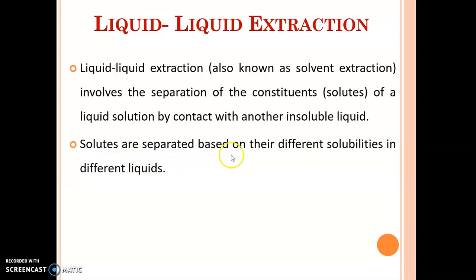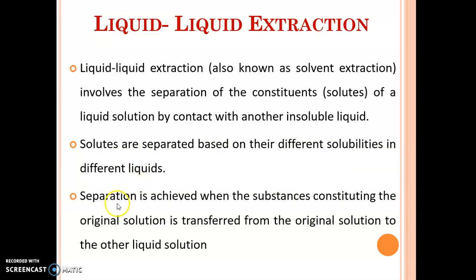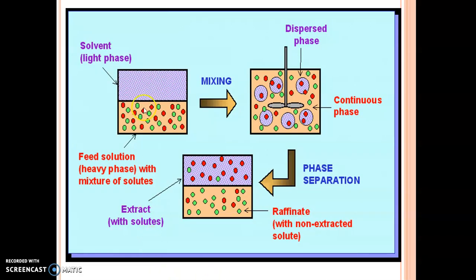Solutes are separated based on their different solubilities in different liquids. Separation is achieved when the substances constituting the original solution are transferred from the original solution to the other liquid solution. So this is the principle behind liquid-liquid extraction technique.